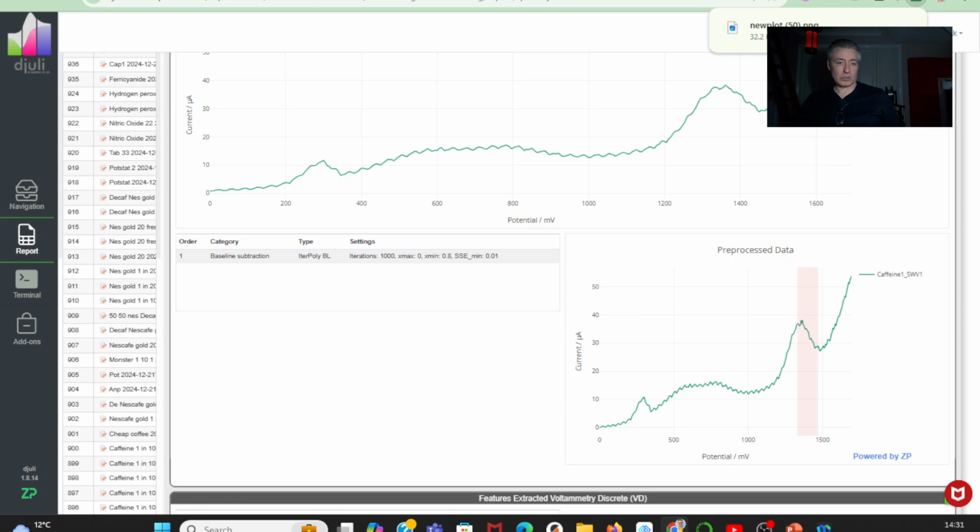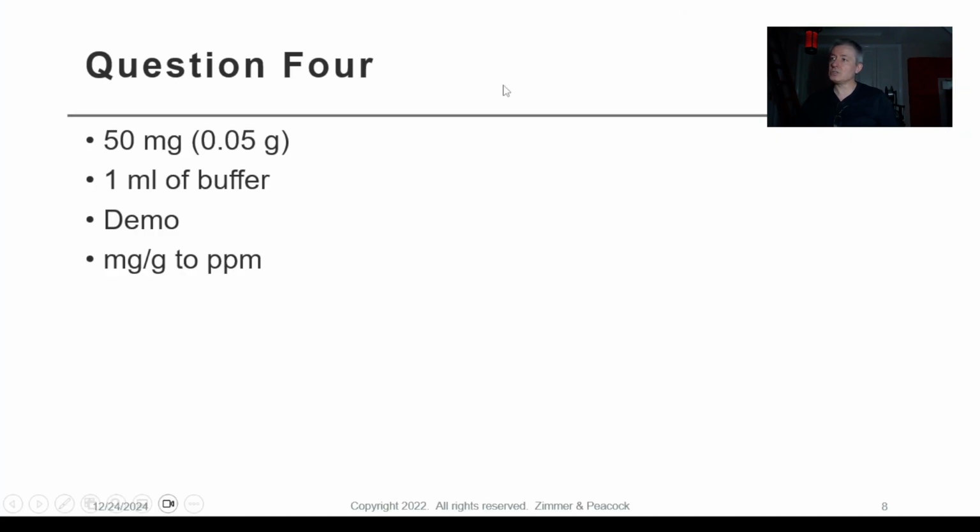All right, let me go back and answer some questions. 50 milligrams of the solid, suspended in 1 ml of the buffer, vortex it. You just saw me do a demo on that kind of sample. The result you'll get is milligrams per gram, which means how many milligrams of caffeine in 1 gram of that sample.